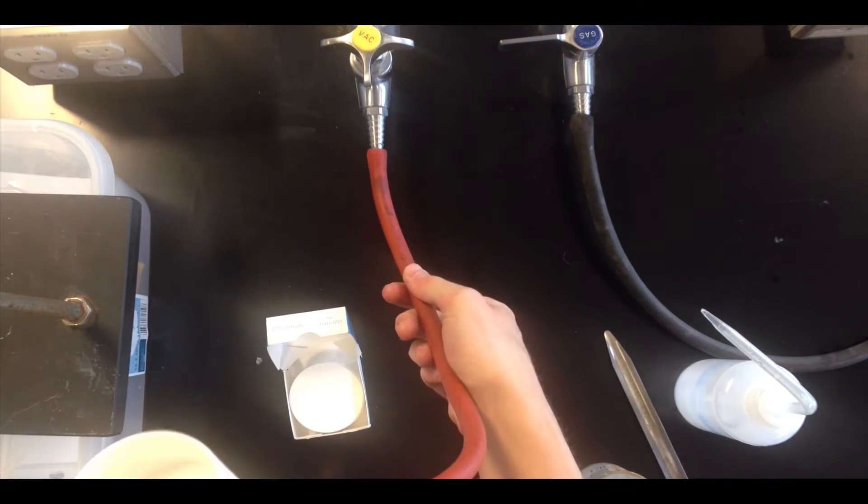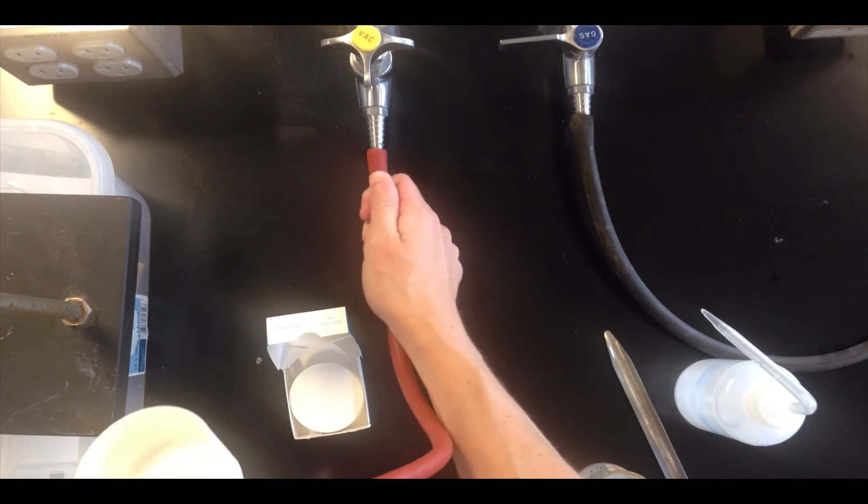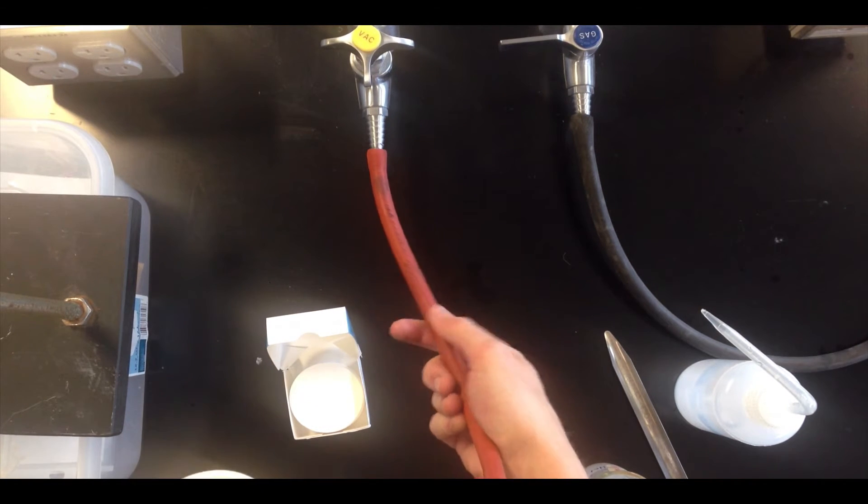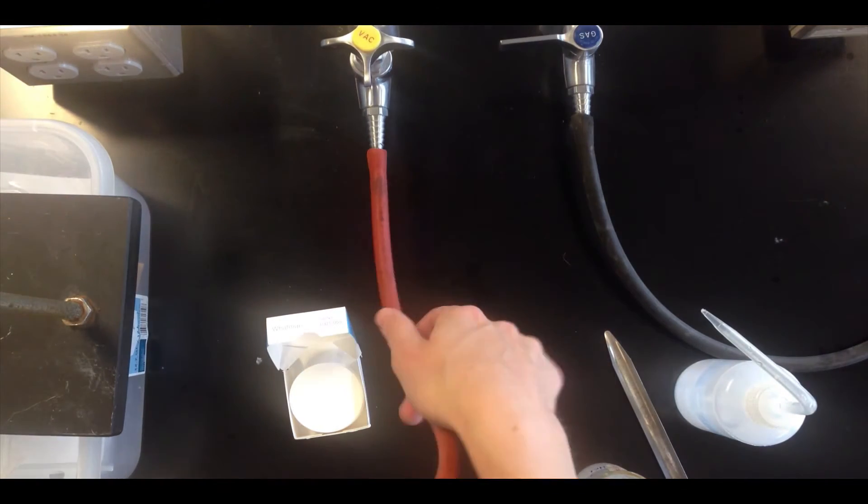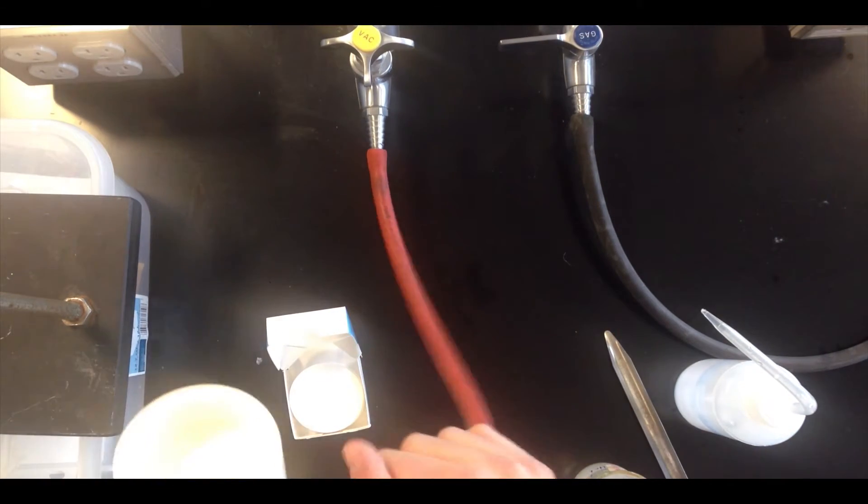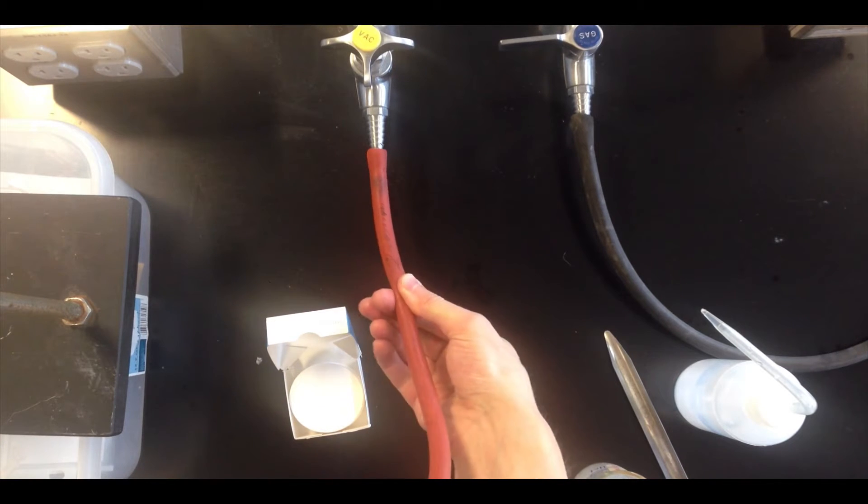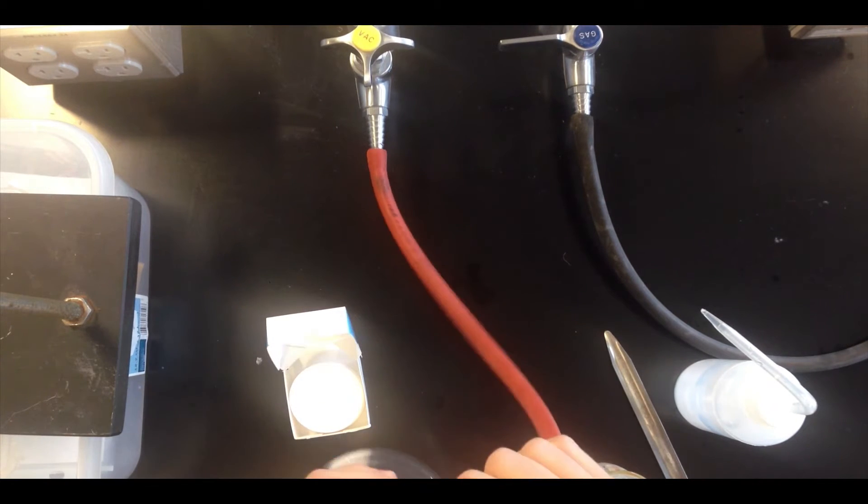You'll also notice that this tubing is a little bit thicker than the gas tubing in many cases, and we want to use thick tubing with the vacuum tap because we want the tubing to hold its shape when the vacuum starts pulling air out of here, and only the thicker tubing is able to do that. You won't get good vacuum if you use thin-walled tubing that crimps up like this when you turn the vacuum on.